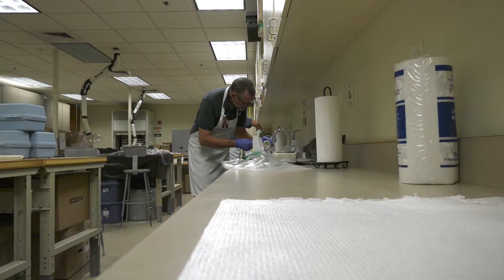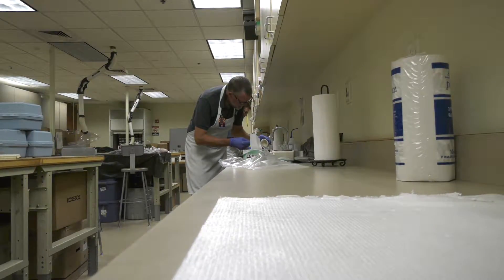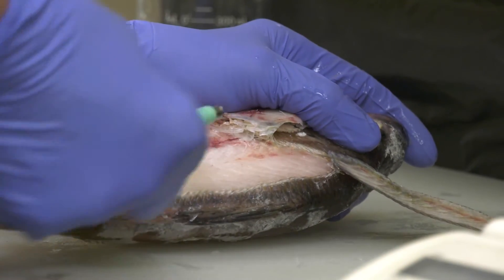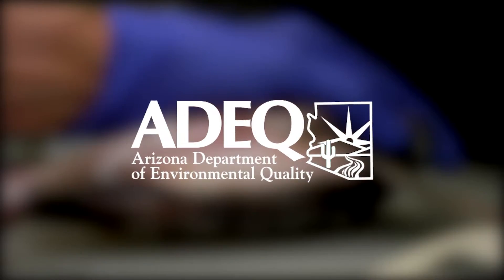Once we have that all out, we cap it off and we freeze it. Within a week of getting the data, we will either have a fish consumption advisory, or if the fish are great, we'll put those data in our database and move on. With the fish consumption advisory, we are protecting the angling public — we want to make sure that the angling public has good fish that they can fish for.